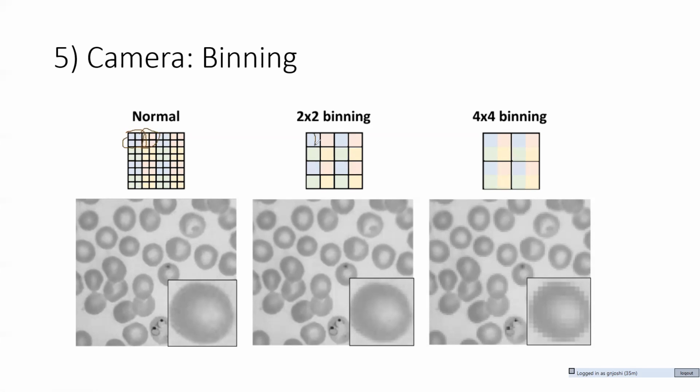Earlier, these were the 4 pixels here, right? So all the intensity you are getting in these 4 pixels is now in 1 pixel, which means that your image becomes a bit pixelated. For example, if you look at this one versus this one, you can see a bit of pixelation happening. So your image will get a bit pixelated.